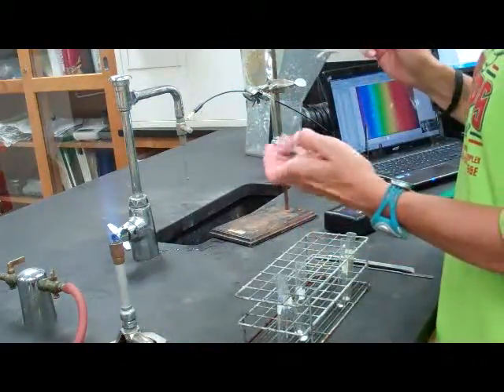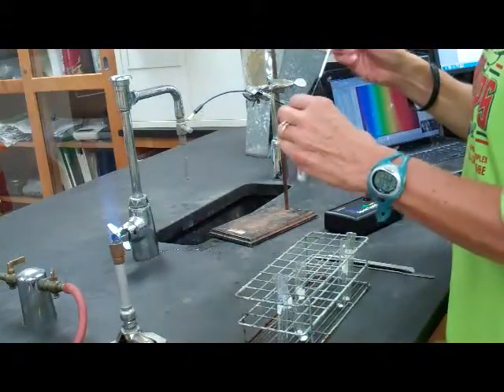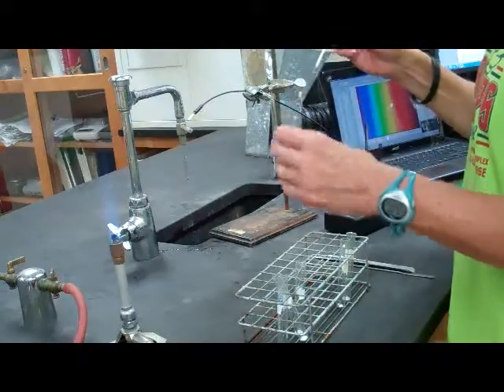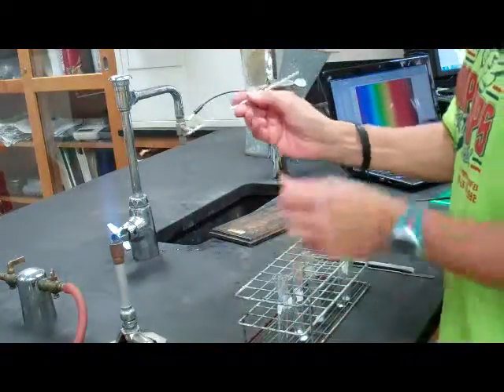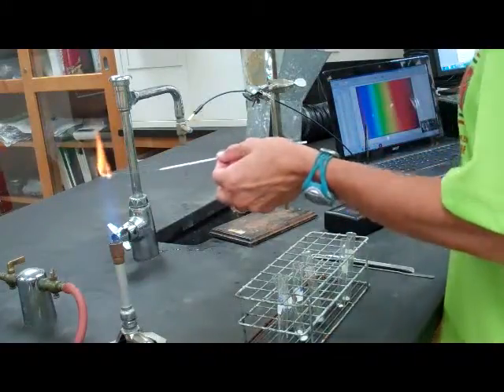Sneaking it in a little. This is magnesium. Magnesium is a bit flakier of a compound.